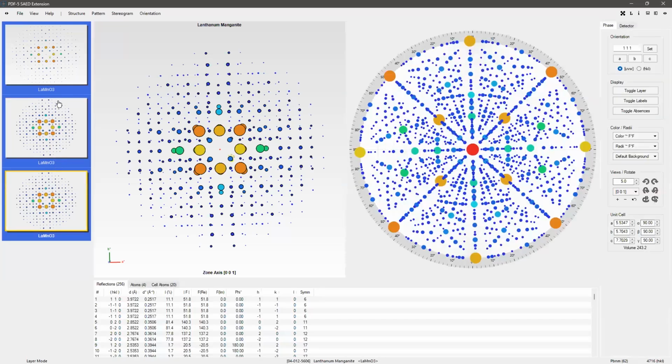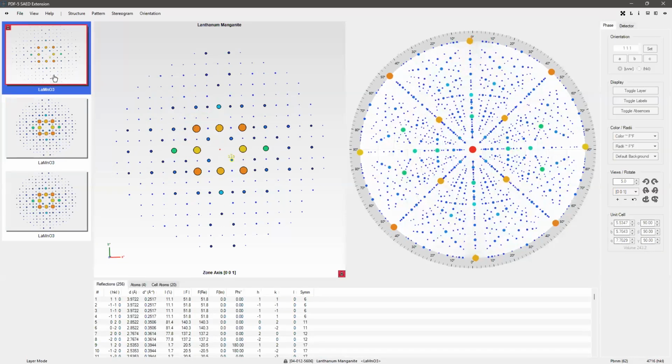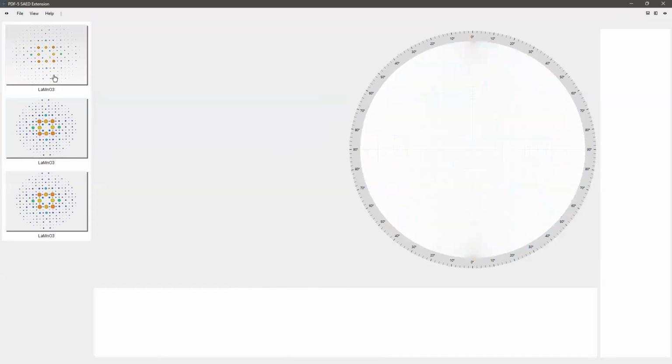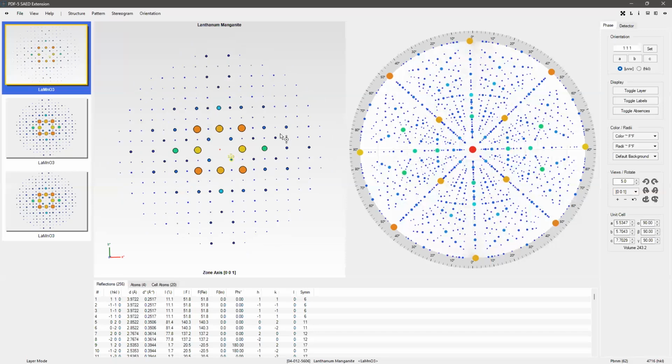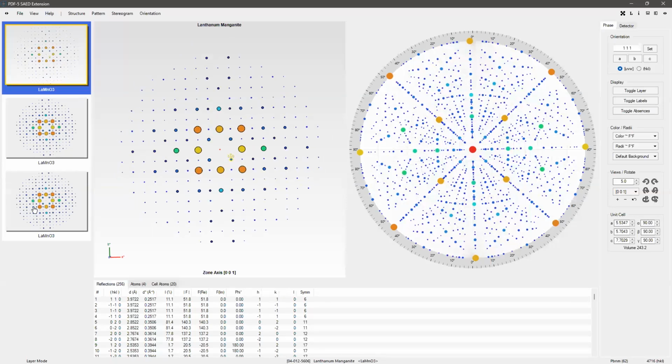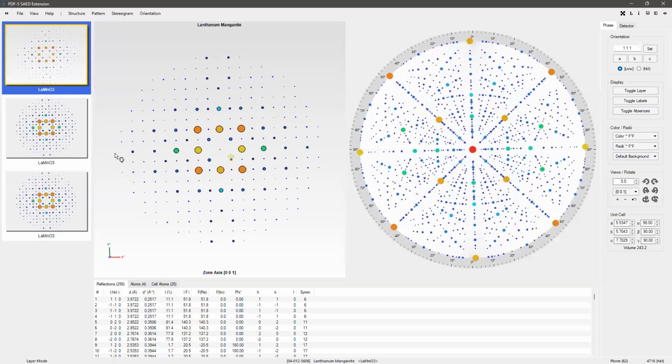So each of these items in the project has 3 selection states, right? It can be unselected. You can also just use the space bar to unselect an item. When it has a yellow frame around it, it's selected and included in the project. So it's being drawn. The draw order is from the top to the bottom. Unselected items will not be drawn.